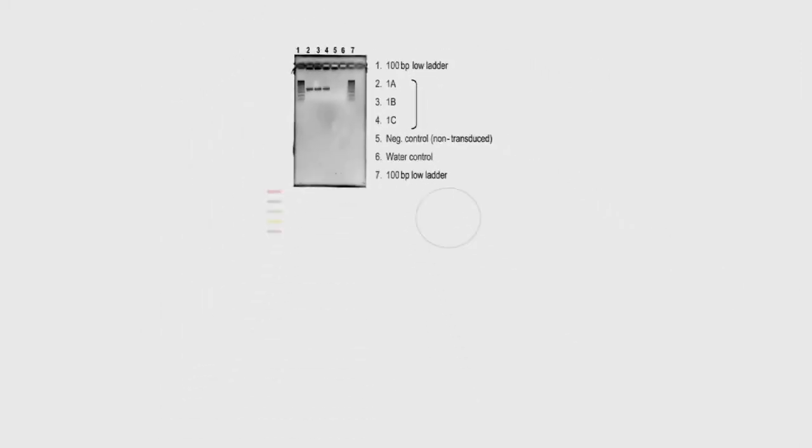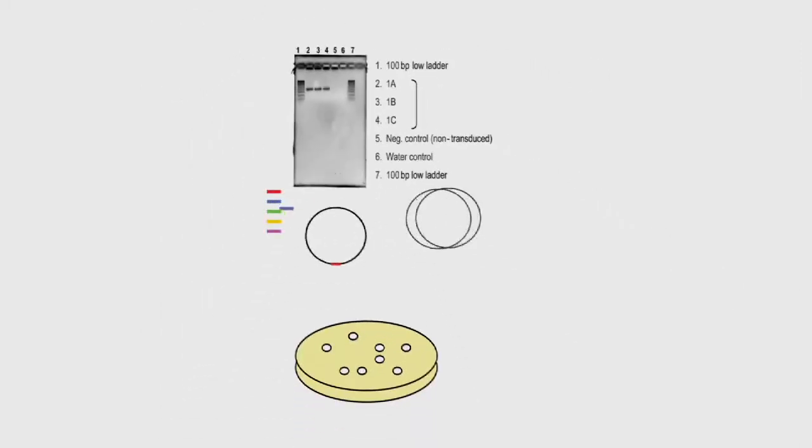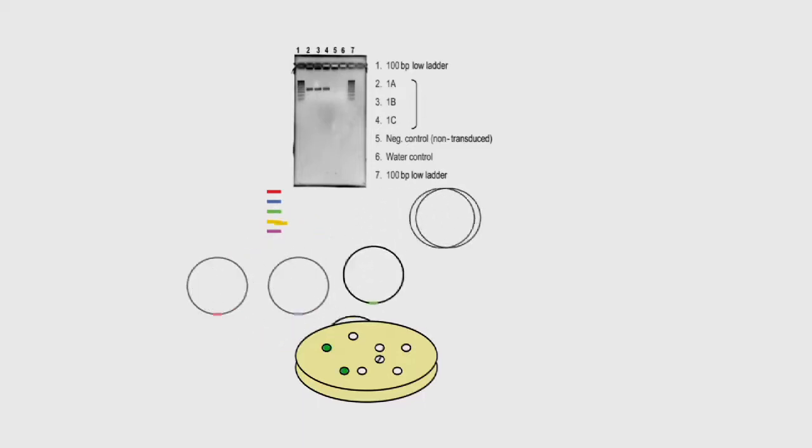At this point, the PCR amplicons are subcloned. TOPO-clone the PCR products using the TOPO TA cloning kit, following the manufacturer's protocol. The result is that one PCR product is contained in each vector.